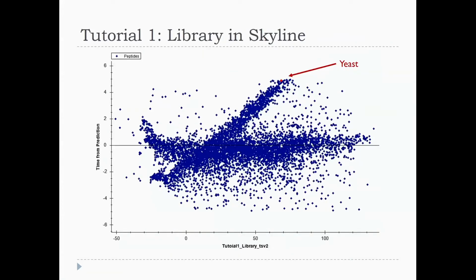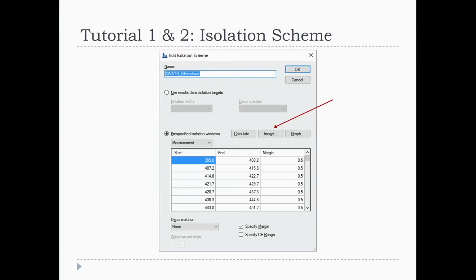Is anybody worried that we might be missing some yeast? Why? Yeah, because the distribution actually seems like it goes out, we're limiting to 5 and the distribution looks like it's going out there. So that's one problem. Here's another thing.